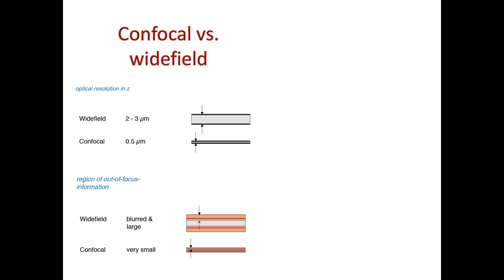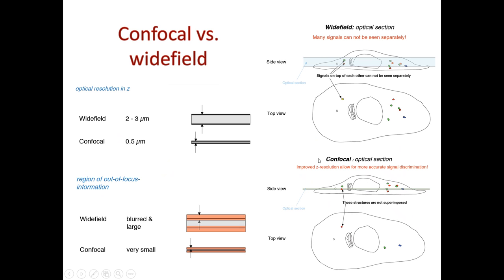Okay. So if you have something fluorescing, there's stuff that is fluorescing from below this plane as well as the plane itself. So when you technically take a section through some object, whatever is inside of this volume, you cannot necessarily see separately, it's in that projection or the image that you're looking at. And that's important to know. So, of course, the thinner that section is, the better, and less superposition you will get.